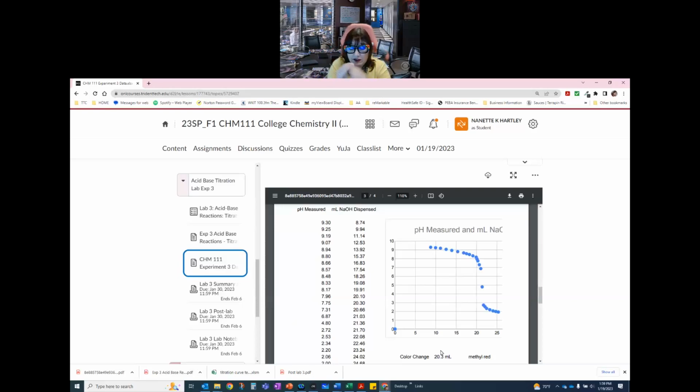It is perfectly fine if you want to make this a little bit smaller and put that in your lab notebook. That's okay. Just make sure that you've signed across it so it's obvious if it's taken out. That's not a big deal. All right, but that is the data that should be in there.